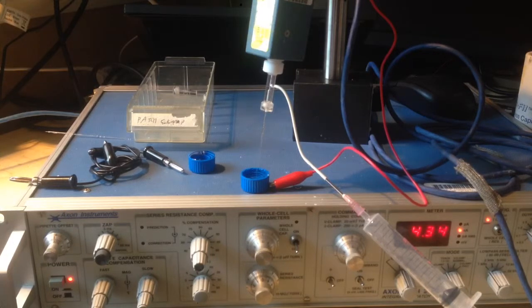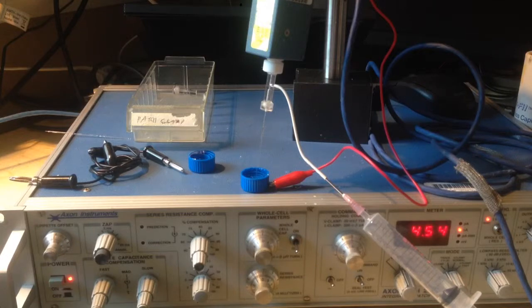I have another Axopatch 200B, so I might try the 200B. I need to get the current measurements in calibration. What's being shown on the scope is the current that's flowing through. So this instrument measures the nanoamp level current that's going through the ionic flow, and sticks out a voltage. And the current to voltage relationship is not well calibrated, so I'll need to figure that out. Anyway, first test. I figured it would be useful to document that at this stage.